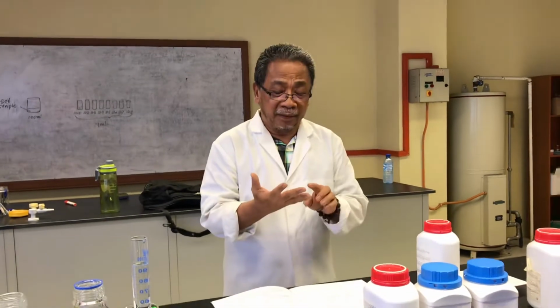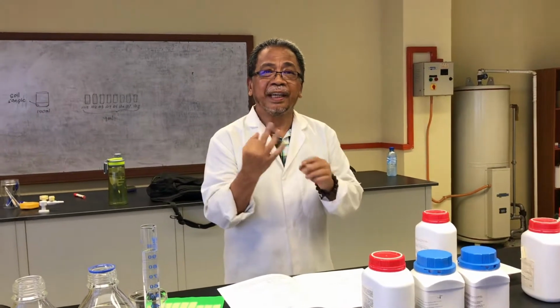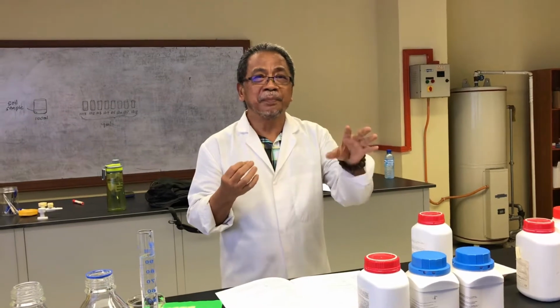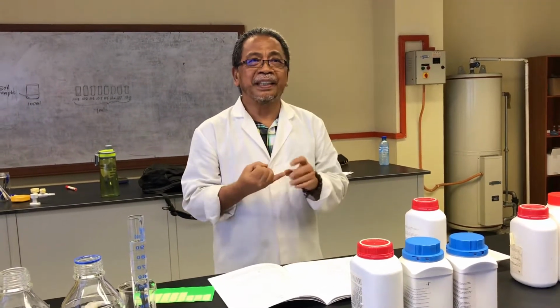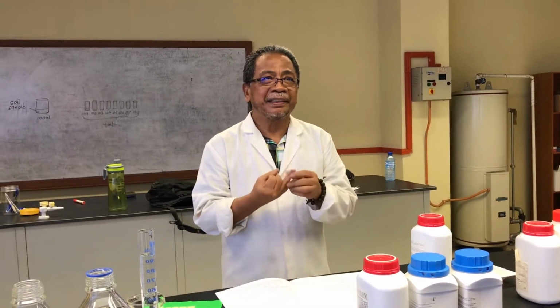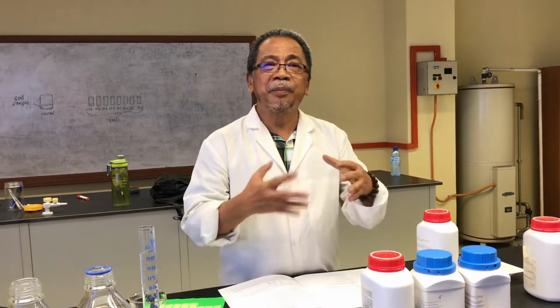For today's video, I would like to make 3 parts. One is we go on tour and we'll show you what are the basic equipment used in a microbiology lab. And the second one, I want to show you how to prepare a media for our heterotrophic microorganisms from the soil. Okay, I'll give you just one example.